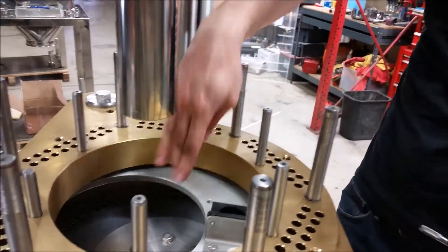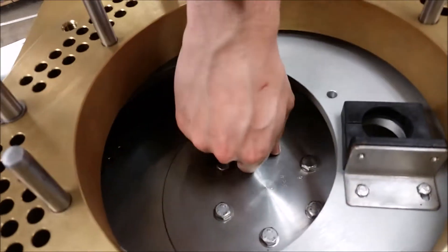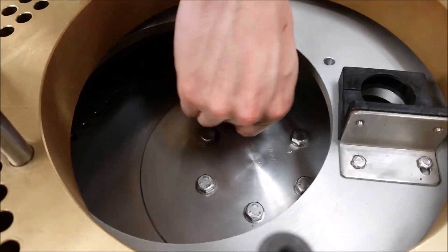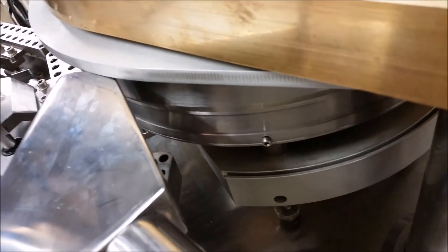To do this first, you're going to want to loosen all of the bolts in the center here, just enough — you don't need to completely loosen them. That lets you then move the disc, rotate it a little bit and shift it as you need to align it.